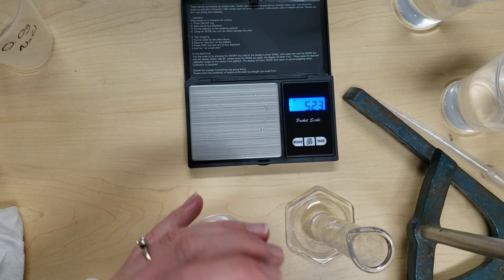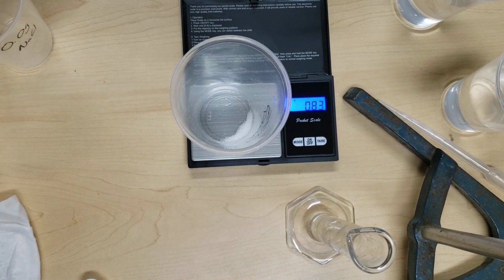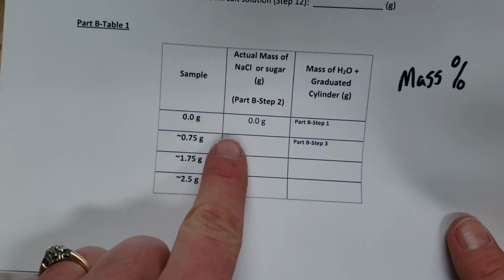The exact amount is not essential, just that it's near 0.75 grams, and then record the exact mass that you weigh out in the table.